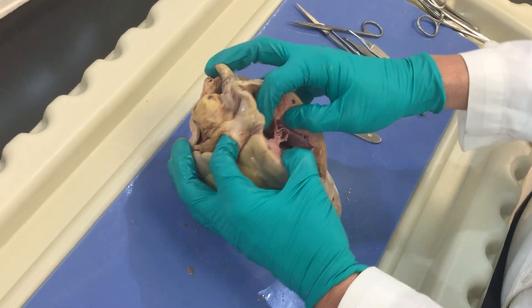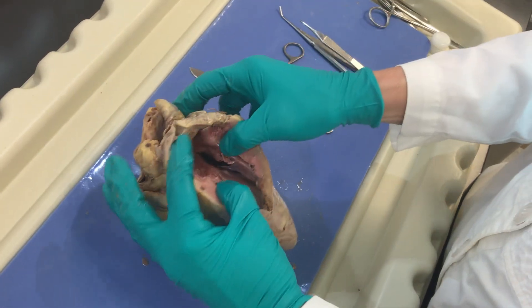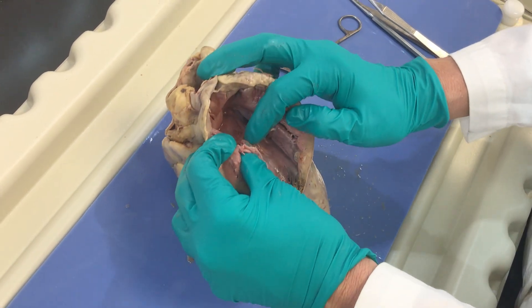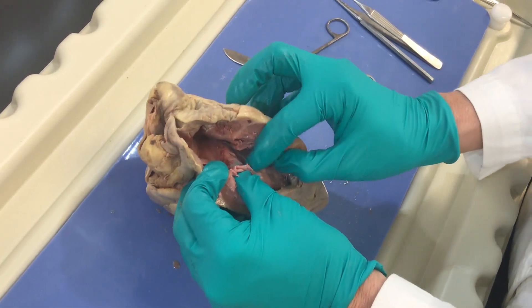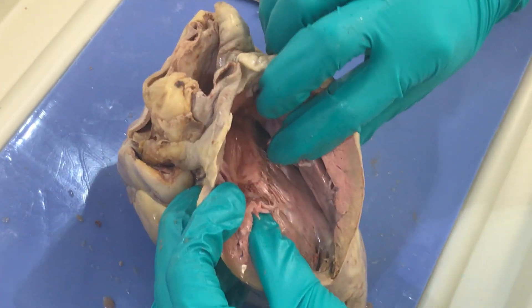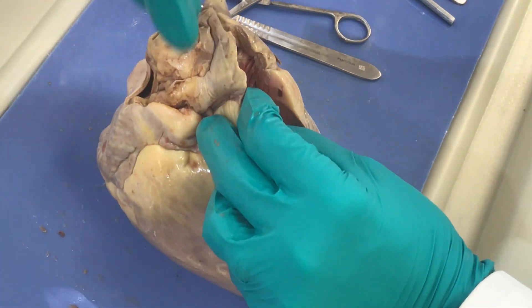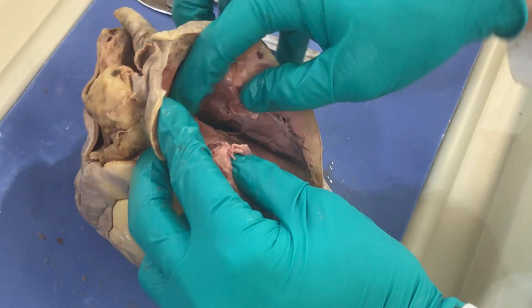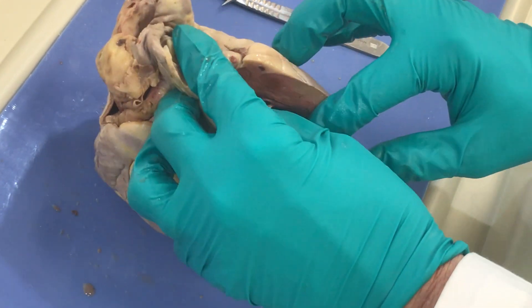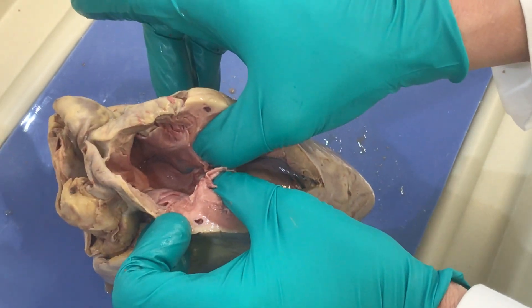Then we have our right AV valve — I'm going to cut through that just so you can see it a little bit better. You can appreciate when we look at these valves, they have flaps. We call these cusps, and these cusps are anchored by these little cords here called chordae tendineae. They are anchored to these swellings here — the papillary muscles. These muscles anchor the chordae tendineae and the cusps of the valves. The importance of this is we want blood to flow one way. As blood drips down from the superior and inferior vena cava into the atrium, the valve is open and blood flows into the right ventricle. When the atria contract, blood is squeezed into the ventricle. As the ventricle starts to contract, blood is pushed up and the chordae tendineae anchor the cusps — this seals and prevents backflow of the blood. Very, very important.